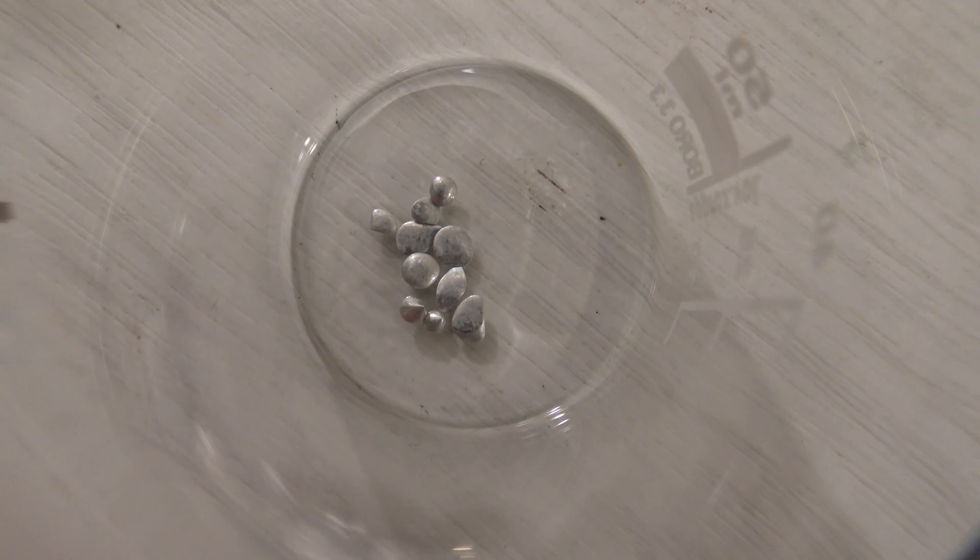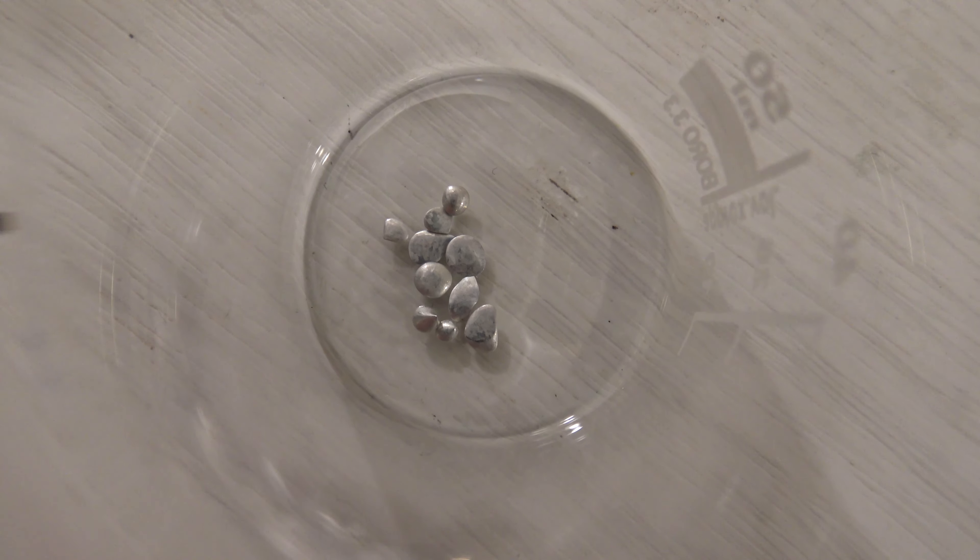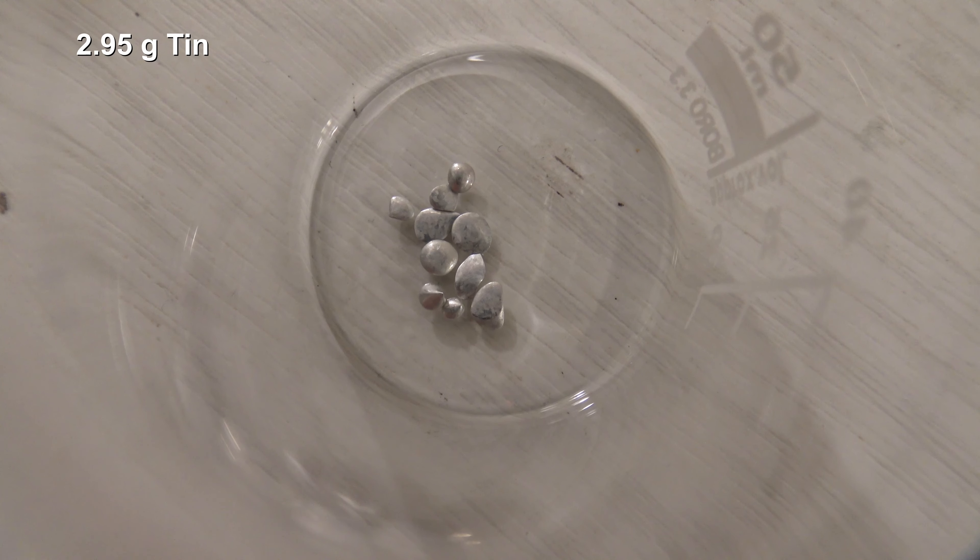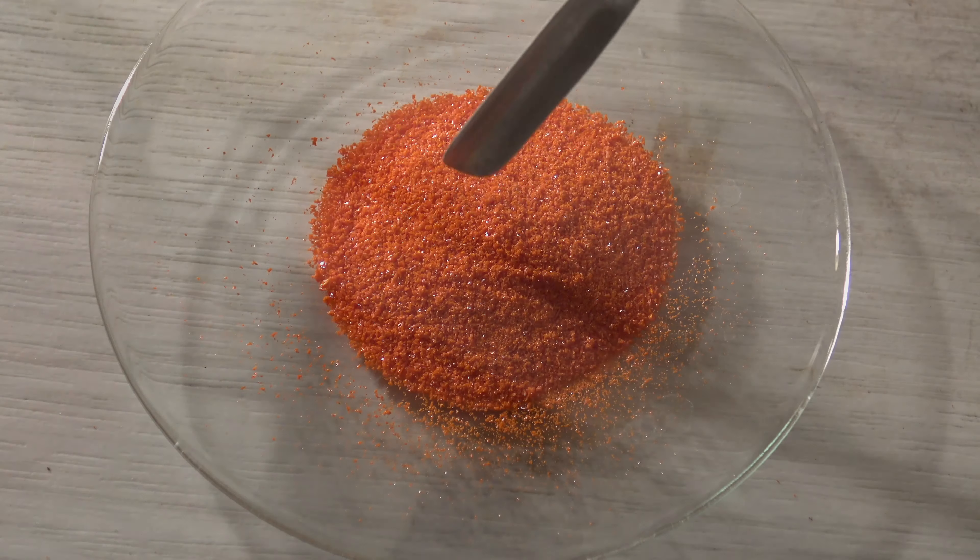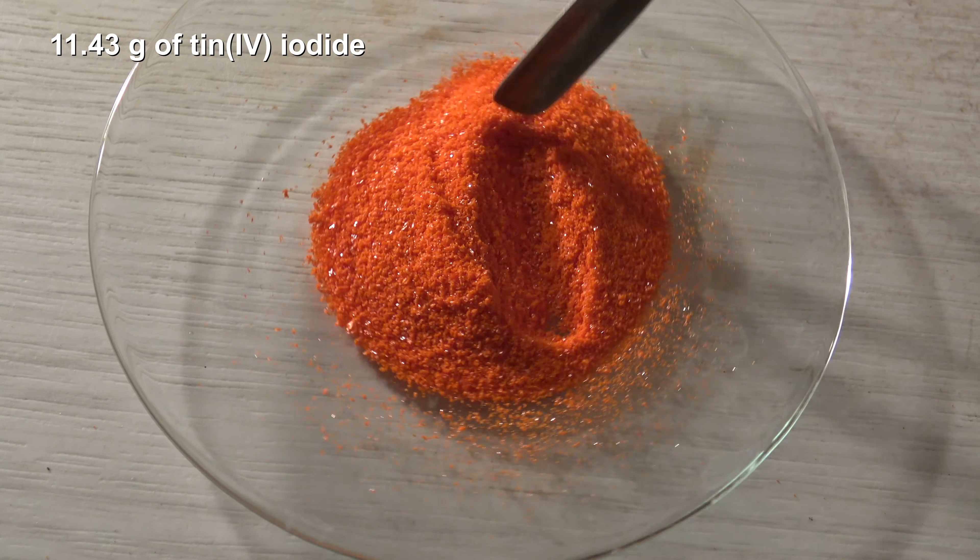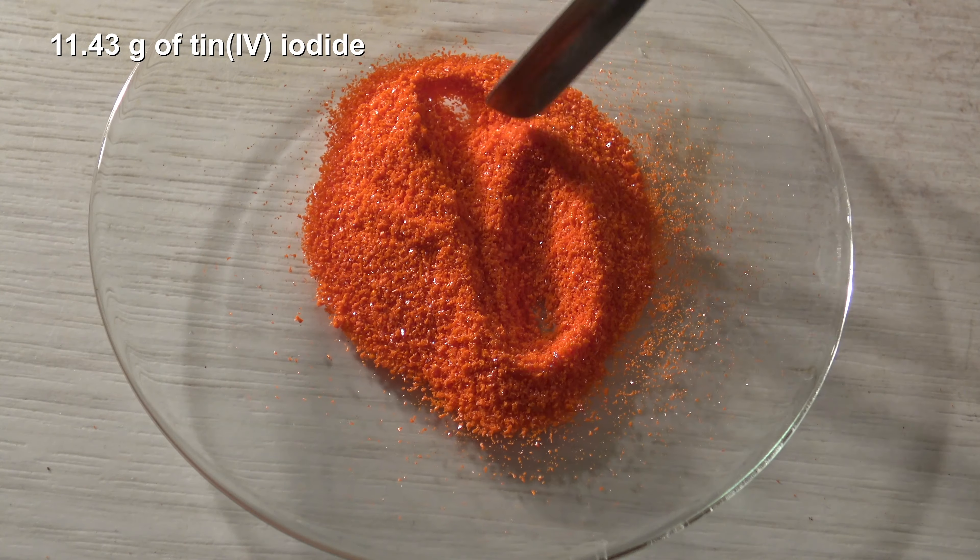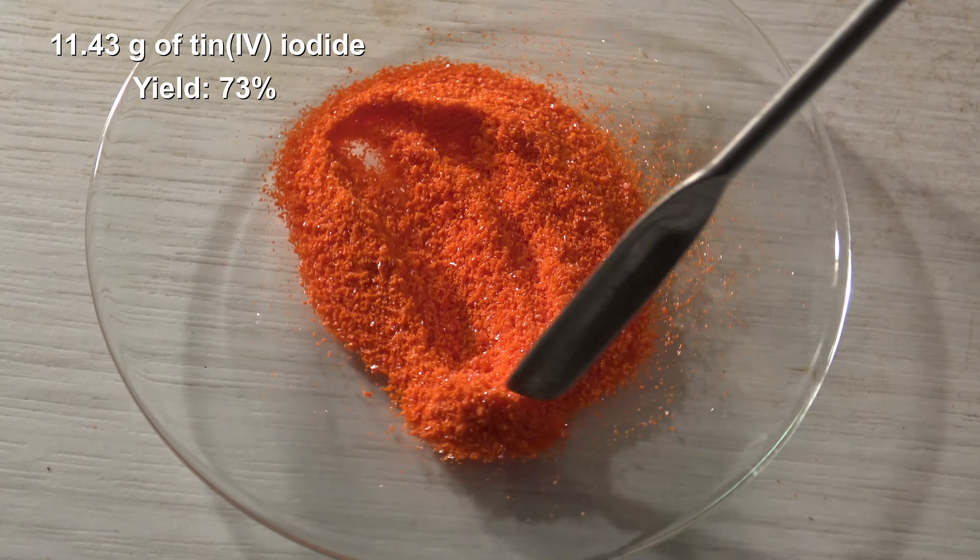To calculate the yield, the residual tin that had been removed after the reaction was weighed out. In total, 2.95 grams of tin had reacted. 11.43 grams of tin(IV) iodide were obtained, which corresponds to a yield of 73%.